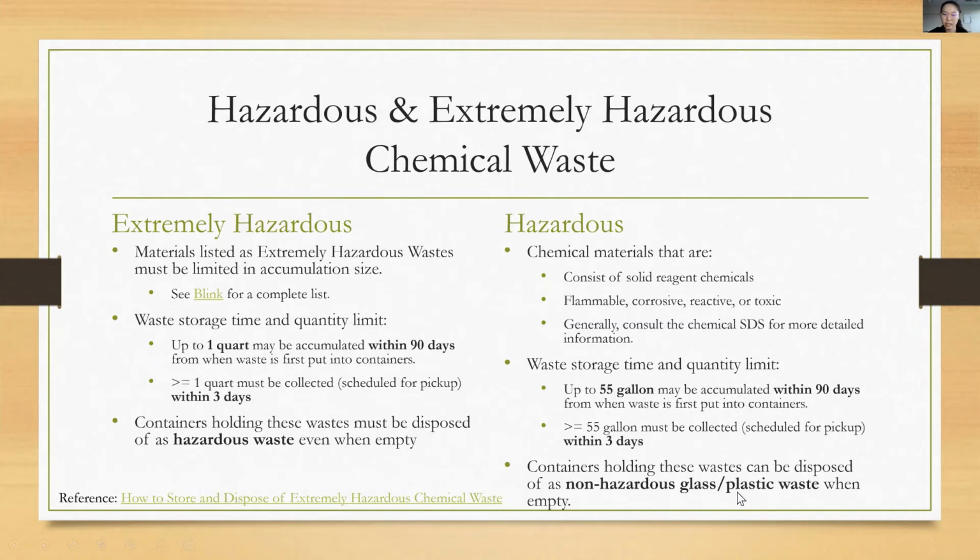So that's why they need to be differentiated. To find them, you can either see this link for a complete list, or you can just go to the UCSD website and search for the extremely hazardous or the hazardous waste.